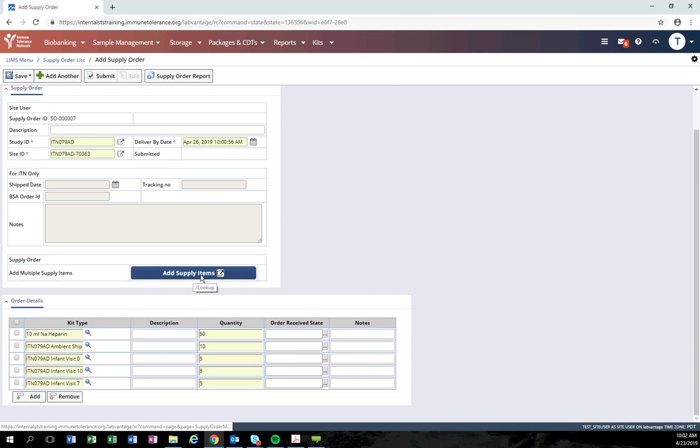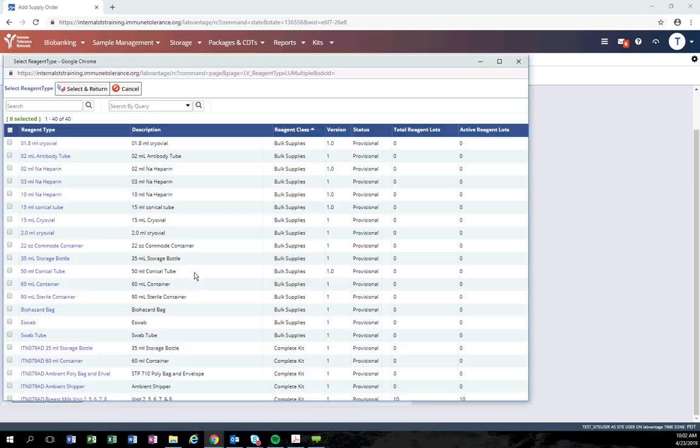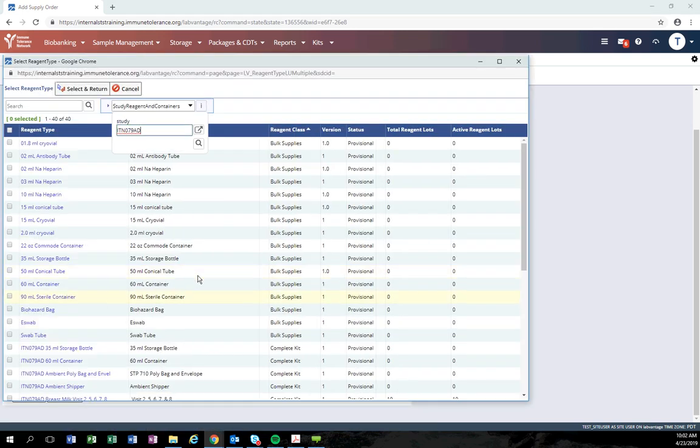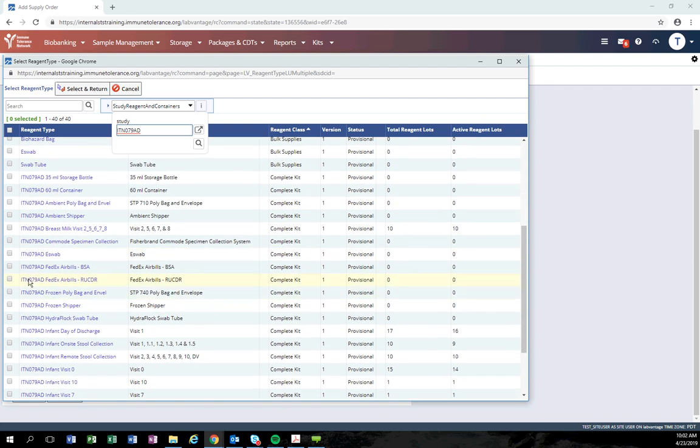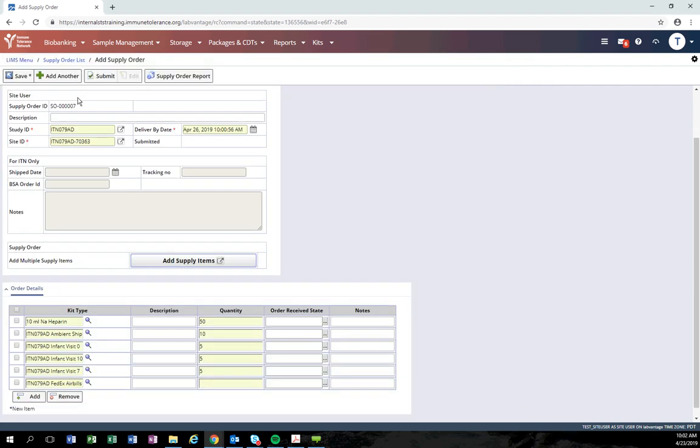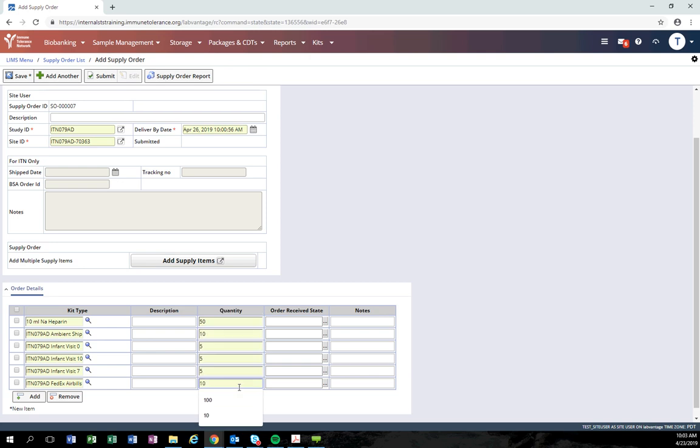If you realize that you need to add an additional item, click the add supply items button and select the appropriate item that you need to add. Enter the item quantity for that new item added. Be sure to click save after any changes to the order.